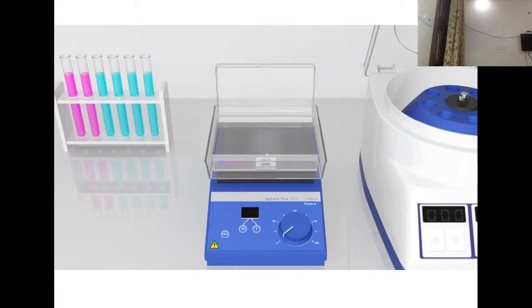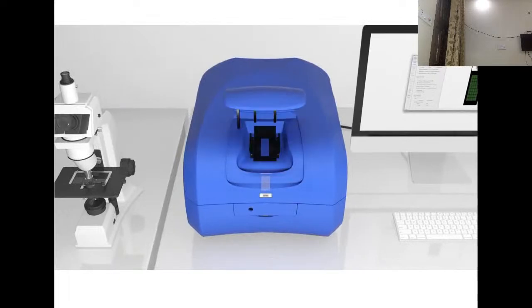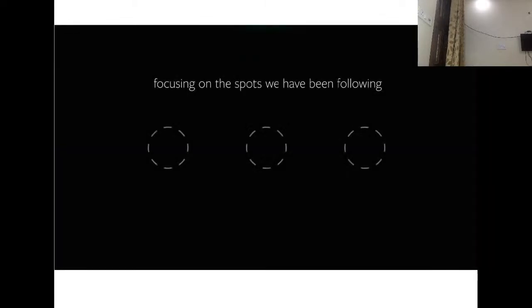We begin by placing the microscope slide containing the microarray inside a scanner. We'll examine the next phase of the process, keeping our focus on the three spots we've been following. First, a green laser scans the microarray. The resulting image is stored on a computer for later analysis. Now it's time for the red laser. This image is also stored on a computer for later analysis. Now, we move to the analysis phase.